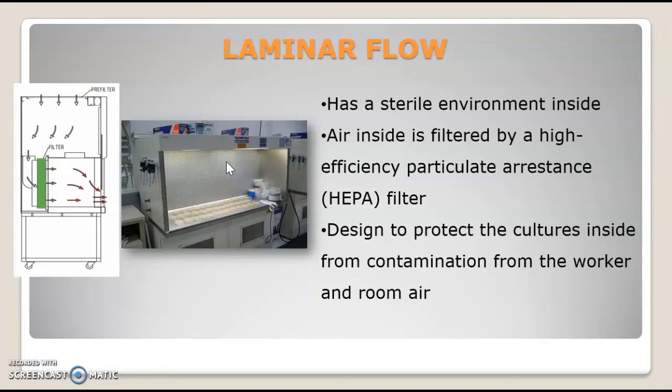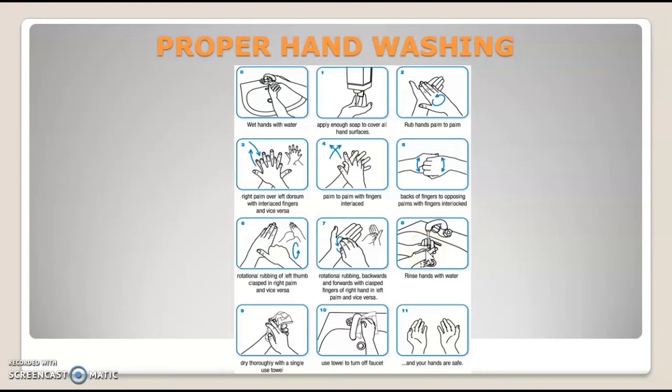The commonly used workstation in a microbiology lab will be the laminar flow, as shown in this diagram. Before conducting any microbiology work, what you need to do is wash your hands thoroughly. Washing hands for at least 20 seconds is very essential prior to conducting any microbiology lab. It could also save you from COVID-19.